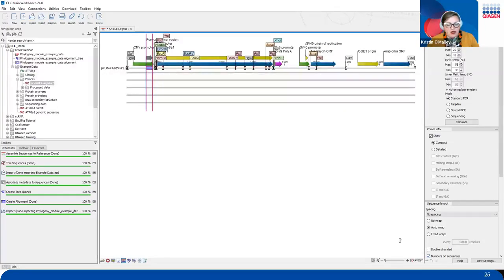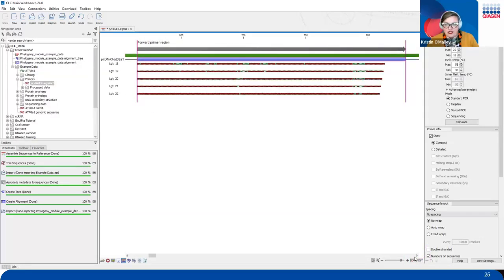Then using the zoom tools at the bottom, I'm going to go to the selection tool right here and zip right into our selected region, where now you can see all of these dots showing up on all of these five lines that are populated on the primer design screen. First things first, each one of these individual lines is specifying different length primers.